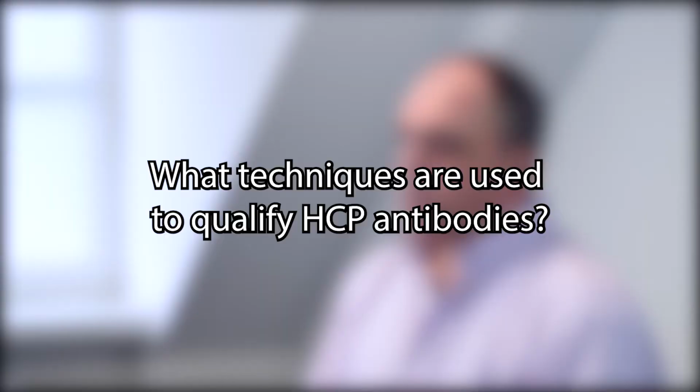That can be done a few times, and what happens over time when it works right is that you start to develop an immune response to the poorly immunogenic proteins. What techniques, for example 2D Western blot or DIGE, are used to qualify HCP antibodies?